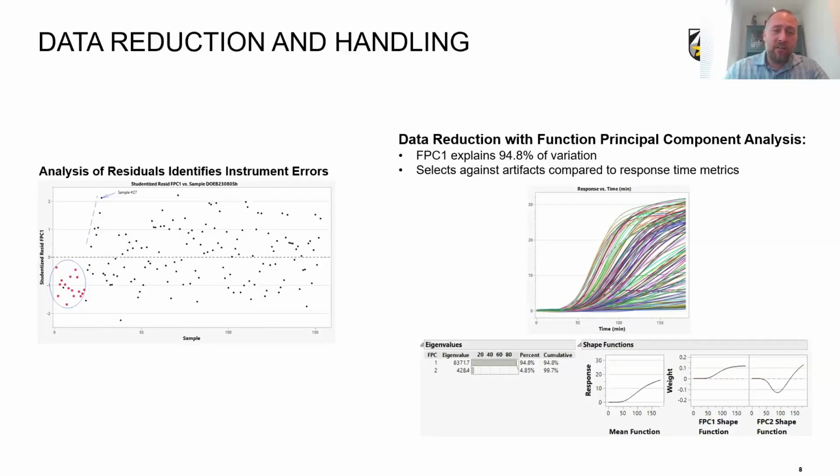And so, here in the second DOE that we did, we saw that there was a systematic set where the first few reactions there was no activity, and the residual plots show this, whereas the rest is nice and randomly distributed. So we assume that that's an instrumentation error, and we can exclude those and proceed, and we're able to get those nice optimals that I talked about.